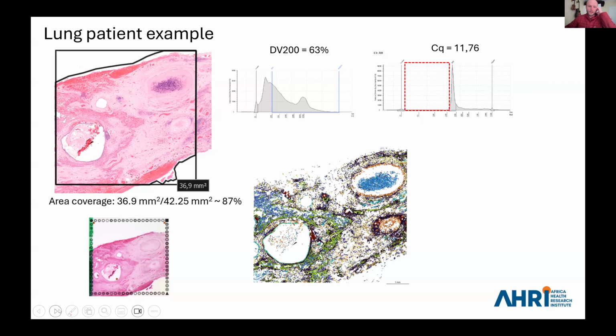And then we sequence these on our Illumina platform, and the Space Ranger pipeline now allows for single cell resolution. So this is really nice and really user friendly. As far as I understand, it is still a StarDist based nuclear isolation protocol, and then it has a nuclear expansion associated with that. So that's how the single cells are selected from your H&E stained slide. So this is then each individual transcript mapped to that single cell bin, essentially.